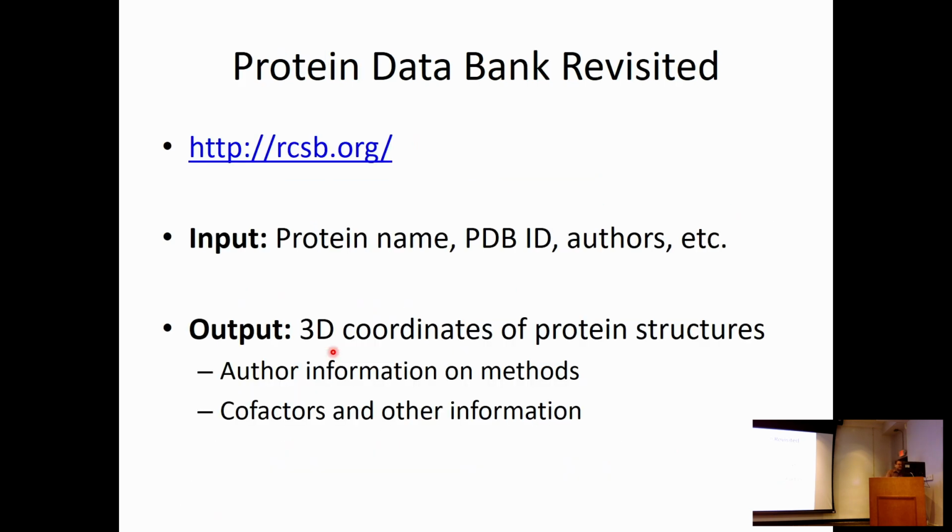Okay, and so let's take a look. So again, this is the PDB, but let's take a look at some structures or some entries in the PDB.